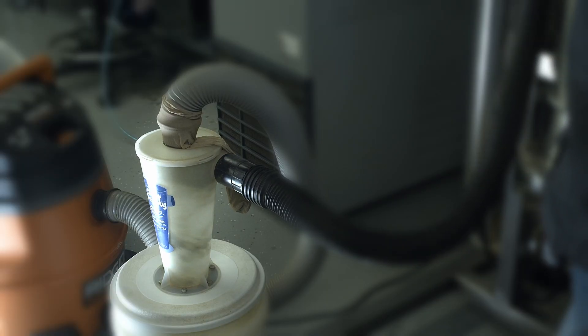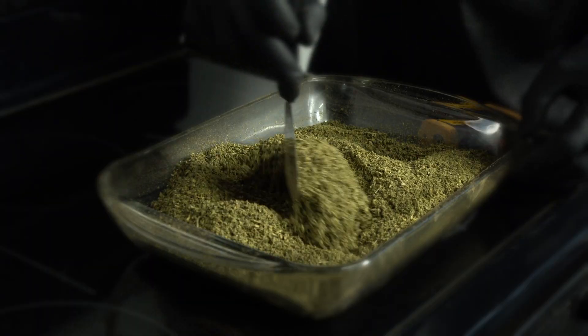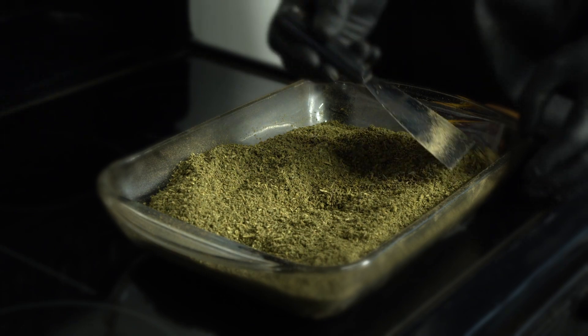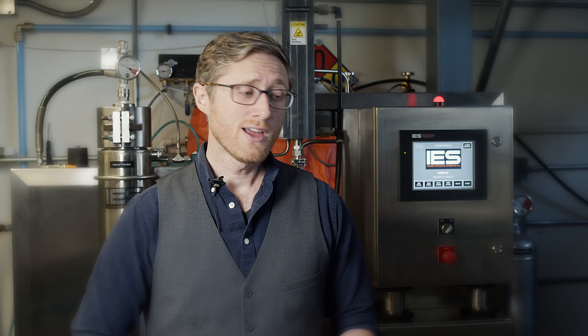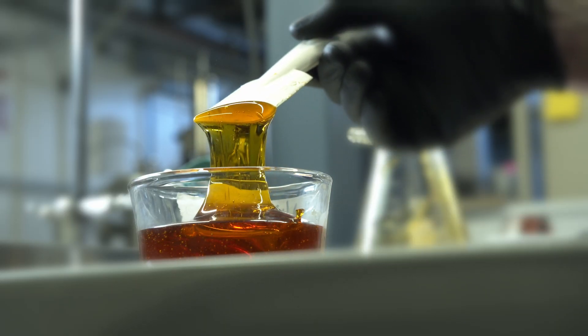After we've extracted the terpenes, we take the biomass out of the extractor and bring it to our decarboxylation department. We convert all of our acid form cannabinoids into their activated forms. After decarboxylation is complete, we reload the biomass into the extractor and pull out all of our oils.